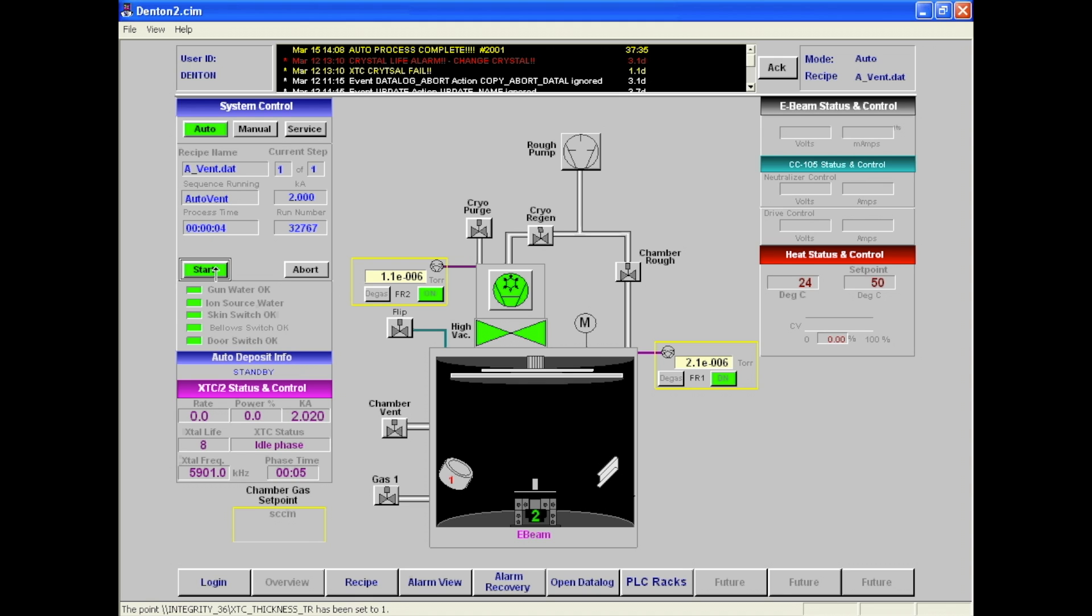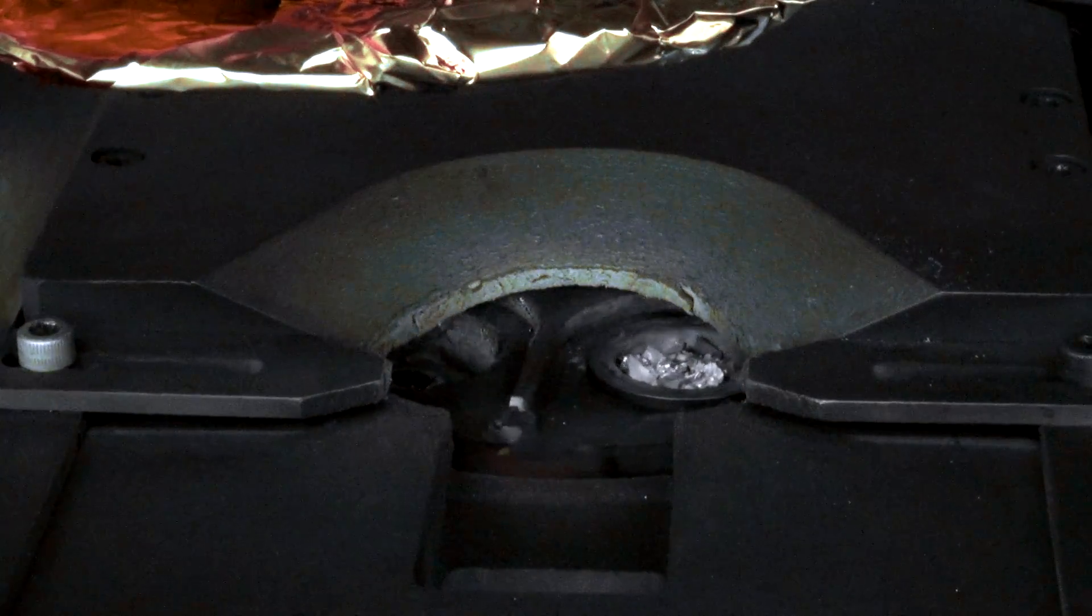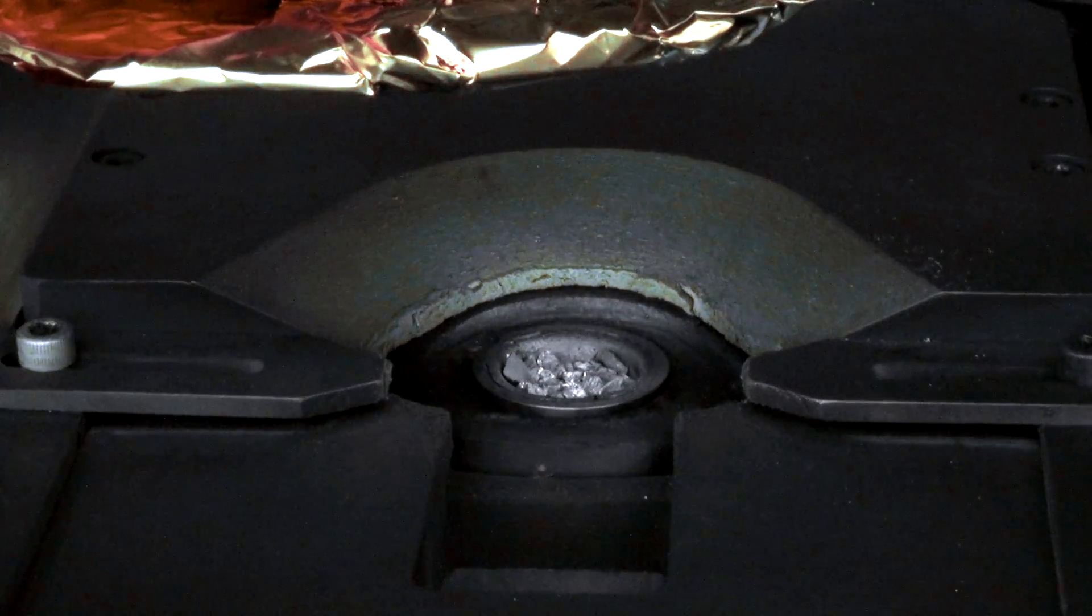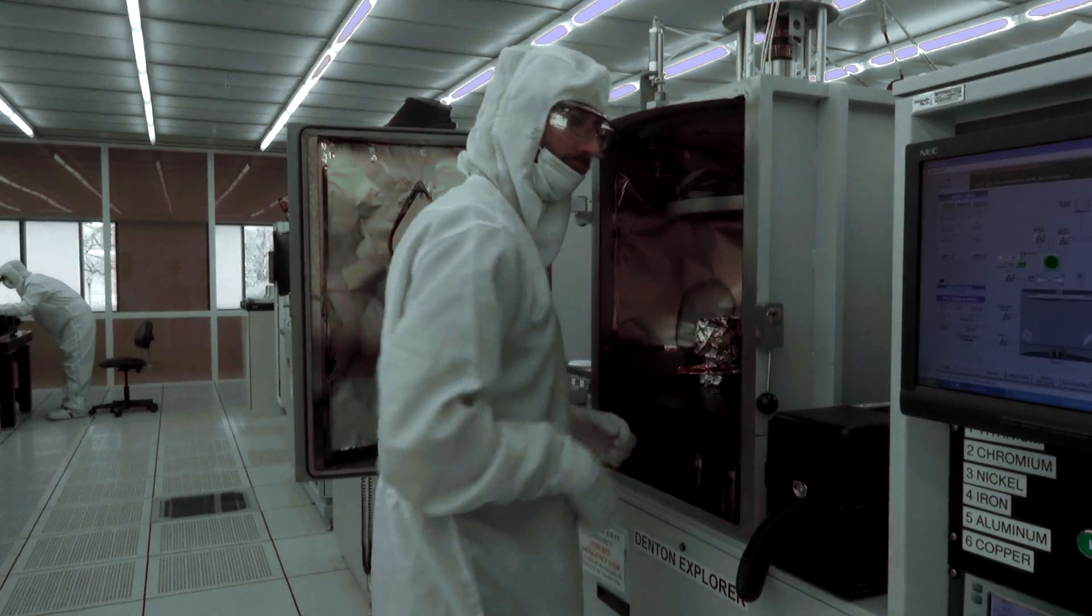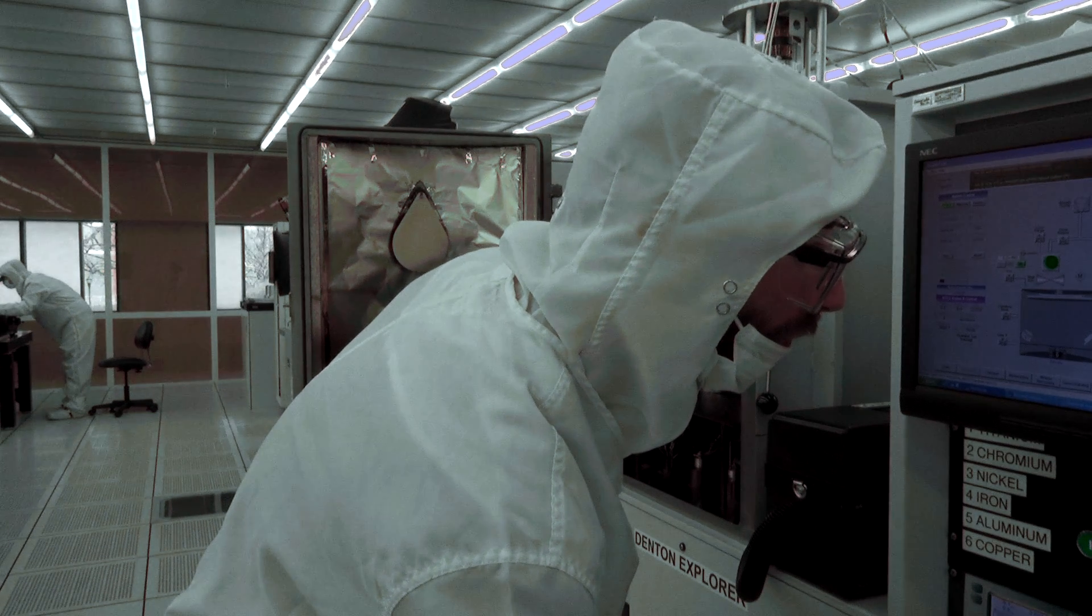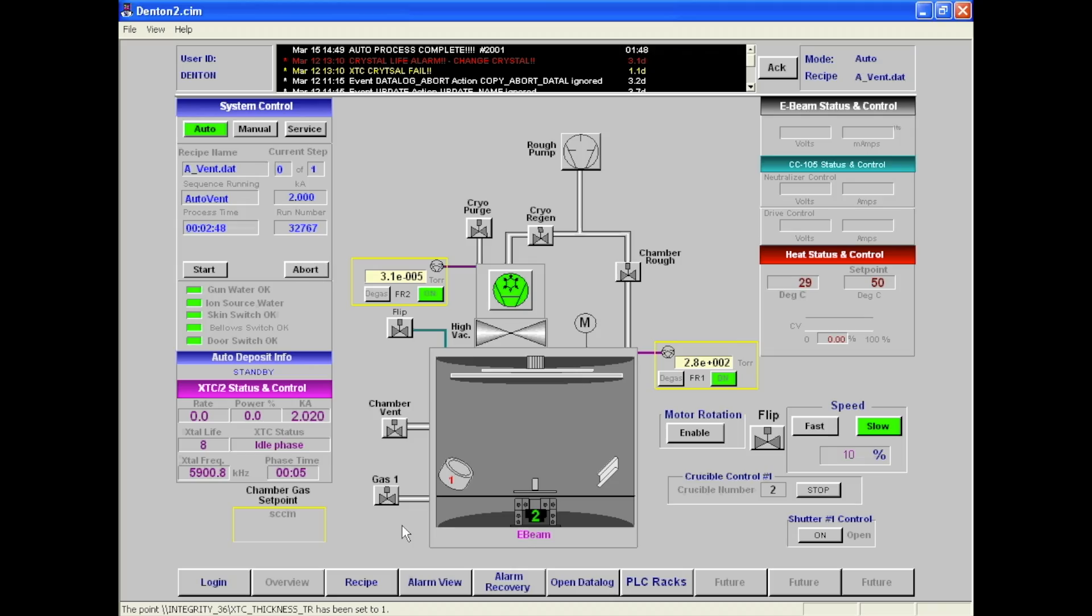Back on the overview screen, click open shutter and then enter the crucible number that holds the desired metal. If the crucible holds enough metal, click close shutter on the overview screen. Then, before closing the chamber, check on the deposition controller to make sure that the crystal life is at a value less than 15.